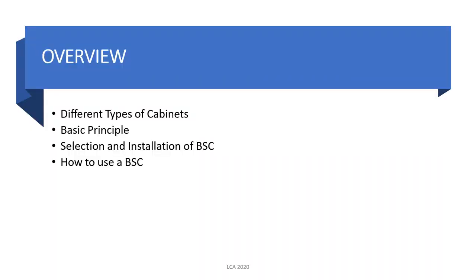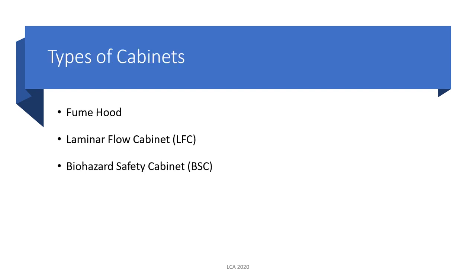Next we go to the different types of cabinets — the basic principles behind each biosafety cabinet, selection and installation, and how to use or manipulate them. We have three types of cabinets: the chemical fume hood, the laminar flow cabinet, and the Biological Safety Cabinet. These three types of cabinets are significant in processing or dealing with reagents and biological hazards inside the laboratory, and serve as added protection for laboratory personnel alongside PPE.